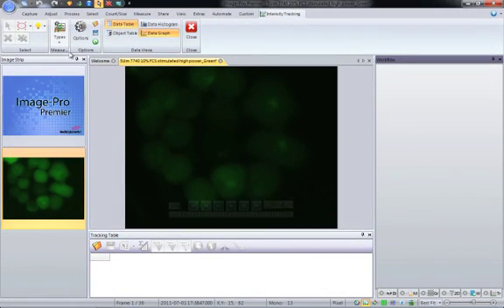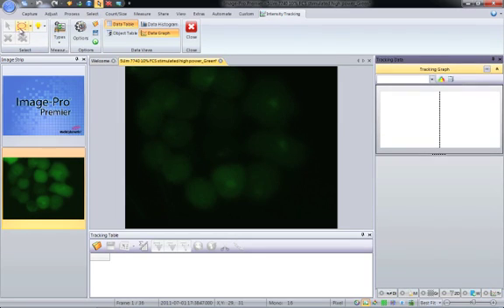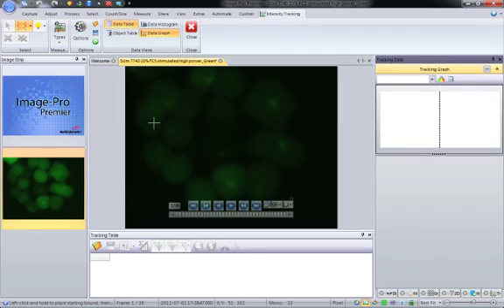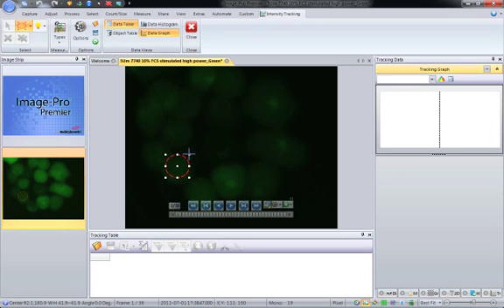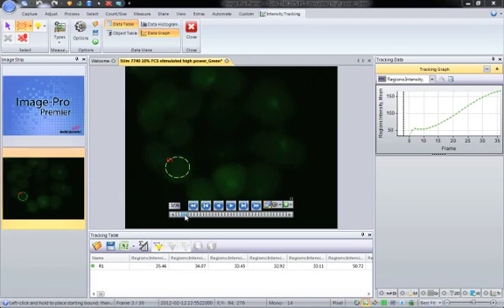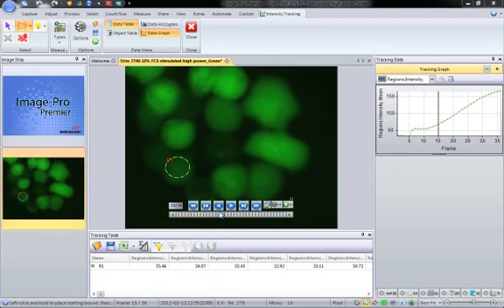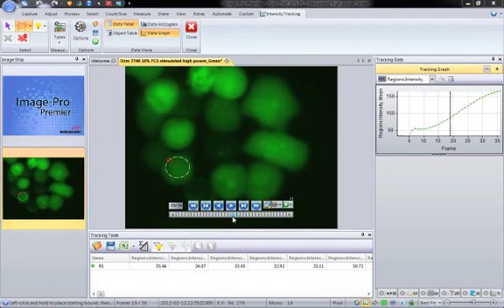And what I am going to do is I am going to draw a region on the image, and as soon as I add this region, you will see the results in the data graph. Now I can go through the sequence, and you can see how the intensity changes throughout.